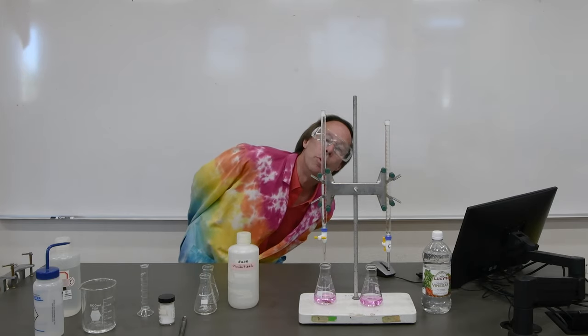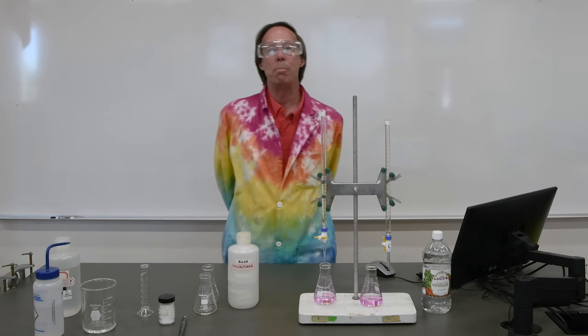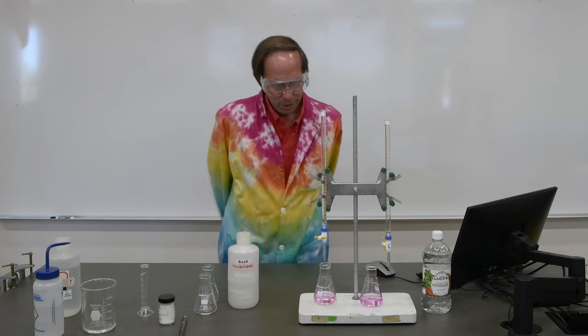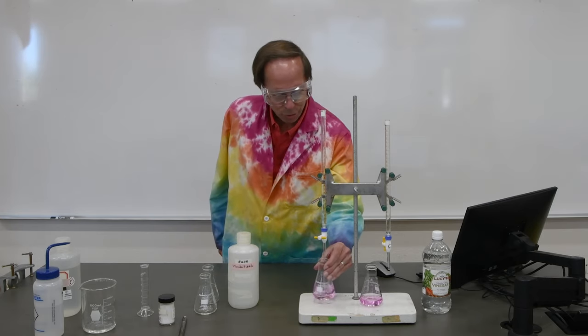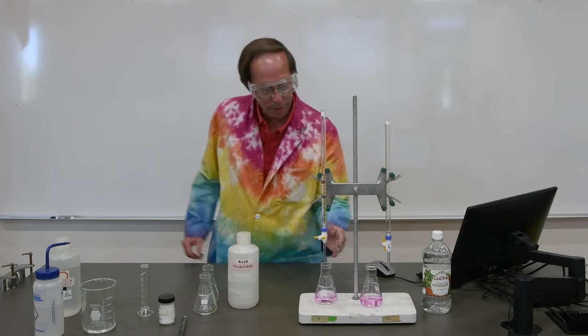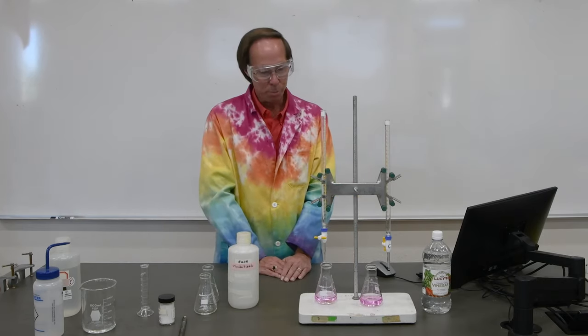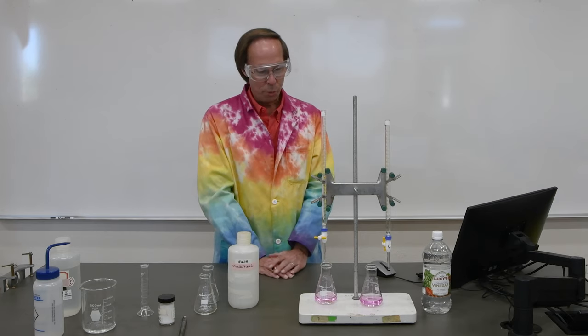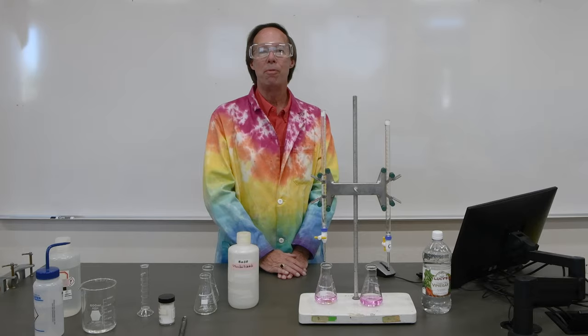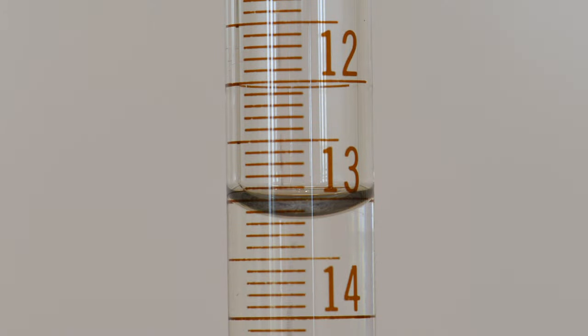And it looks like we've used very close to the same amount, maybe just a slight bit less. So we'll make sure that this lasts for a few seconds here. If the pink doesn't go away, it means we have reached our endpoint. And it looks like we have, so let's go ahead and get a measurement of the volume here. Go ahead and record the final volume for our second trial.